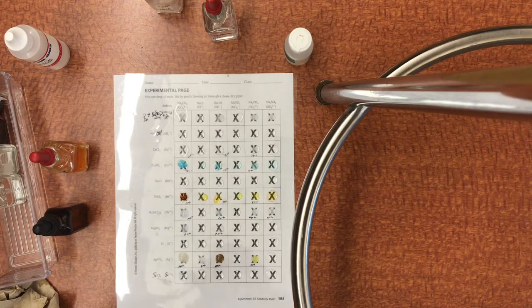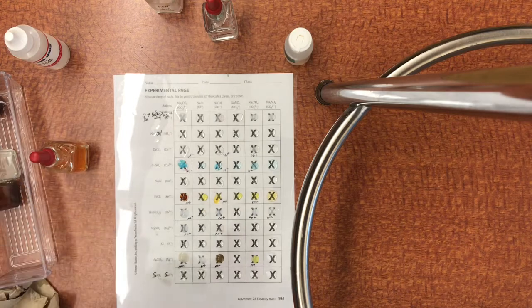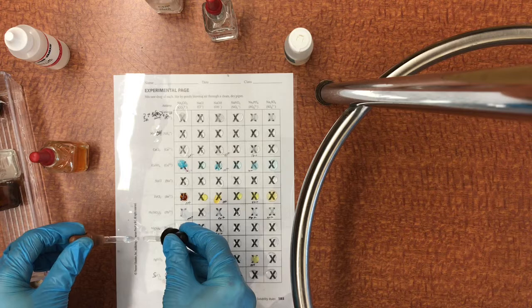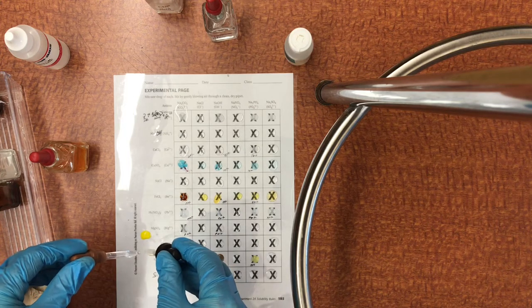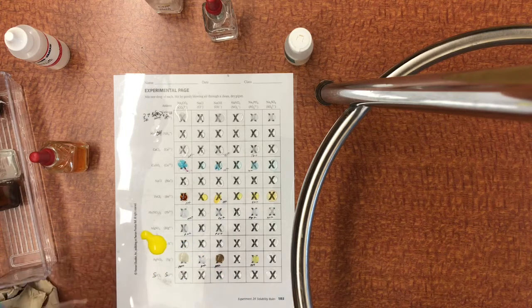I do want to show you one last example, which is a very fun one. It was sometimes done as the yellow rain experiment, and you take some lead nitrate and some potassium iodide, and those are two of the compounds that we did not mix together, and let me see, it's a good spot for it. You get a very strong yellow appearance, and if you time it right, you can kind of make them, oops, oh no, I've contaminated that now.